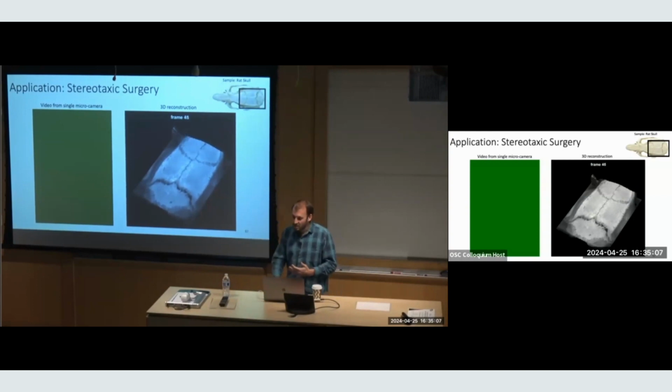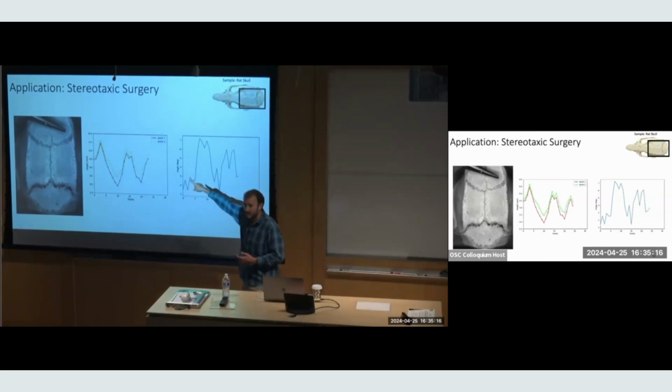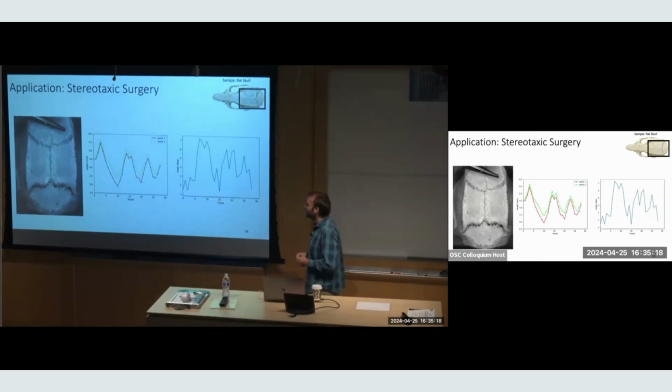But what we can do is track the tool in 3D. So here are just 2 points on the tool, the green and red dot, and then this is their axial location, right? And so we've been doing experiments by moving that with a little stage and measuring our accuracies in tracking the 3D position and angle. And it's significantly higher than we thought. It's on the order of 5 microns in axial positioning, which we were surprised by. So we're really trying to figure out why it is so accurate. That's a separate story.